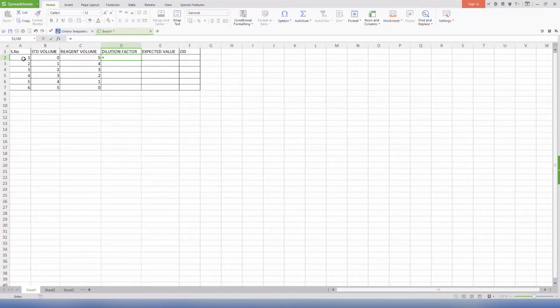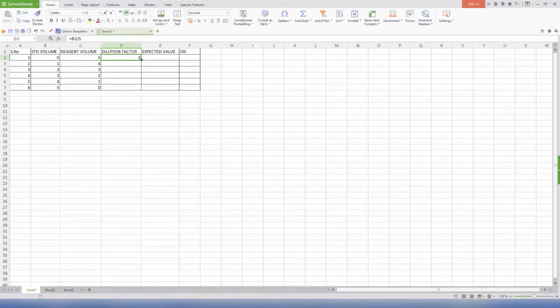For column D2, that is dilution factor, feed in the formula which is equal to B2 divided by 5. Enter, select the formulated cells, and drag down. 5 being the total volume of solution.